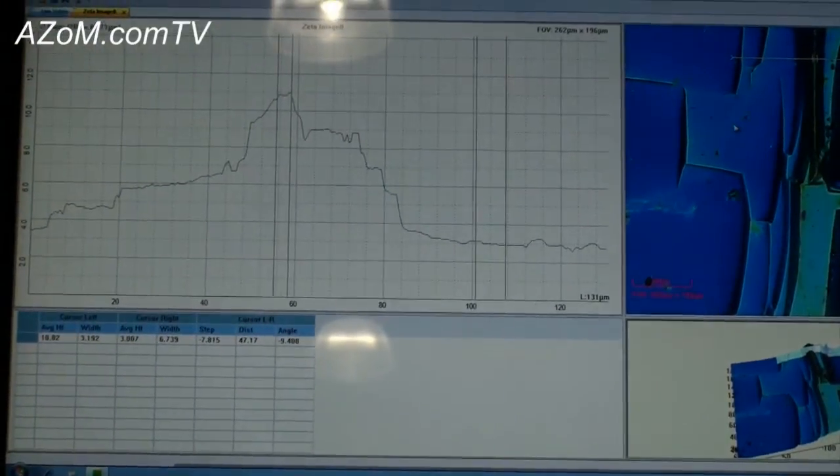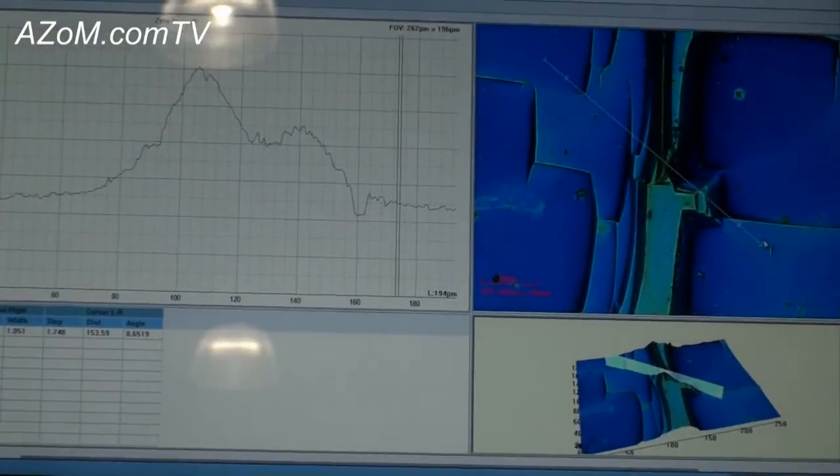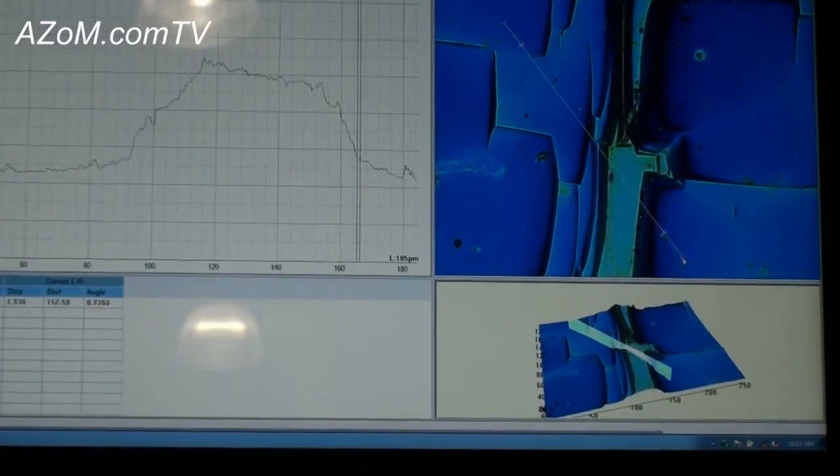I can move these cursors anywhere I want on the screen. I can make them oblique, move them across. I can have multiple cursors on the system.